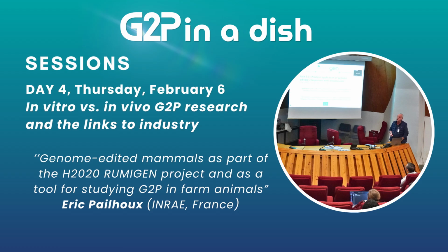No. You can check predicted off-target sites, but in our case, we cannot. It makes no sense to sequence these animals because we do not know the parents. We use 5 donor goats, and then the embryos are pooled to be manipulated very rapidly. Alliance and Aurélie manipulate 15 embryos in 15 minutes. So we cannot check if they are fertilized or not, and we do not know from which goat they come. So it's very difficult to find off-targets by whole genome sequencing.